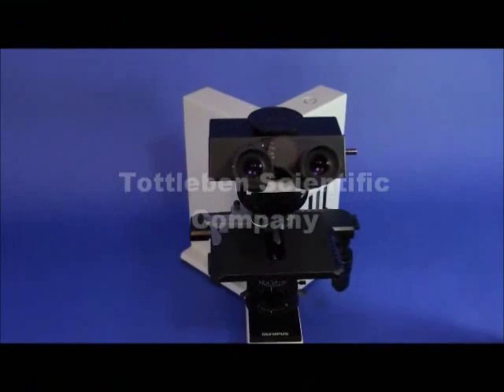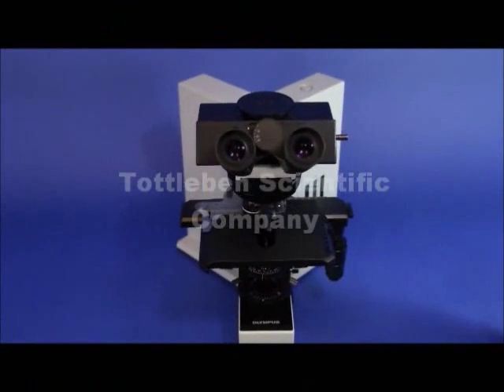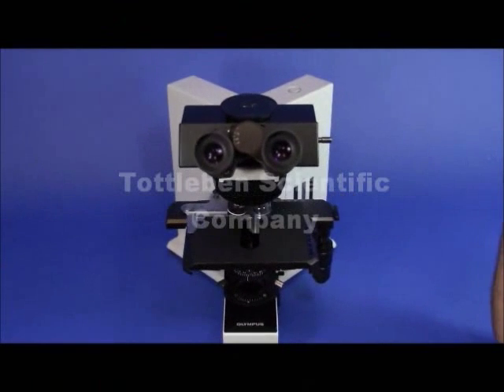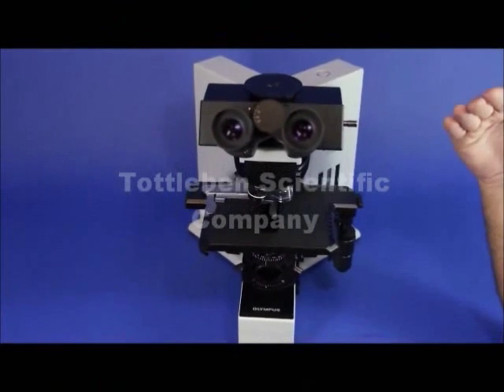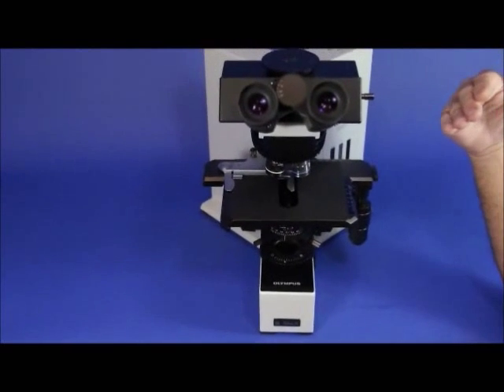So here we have an Olympus BX50. This is considered to be a research grade microscope. And as we go through the components that are on this microscope, you'll quickly understand why that is.